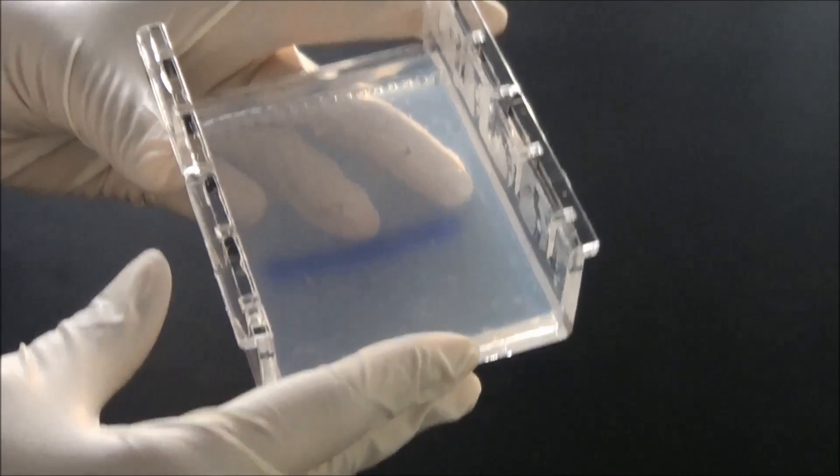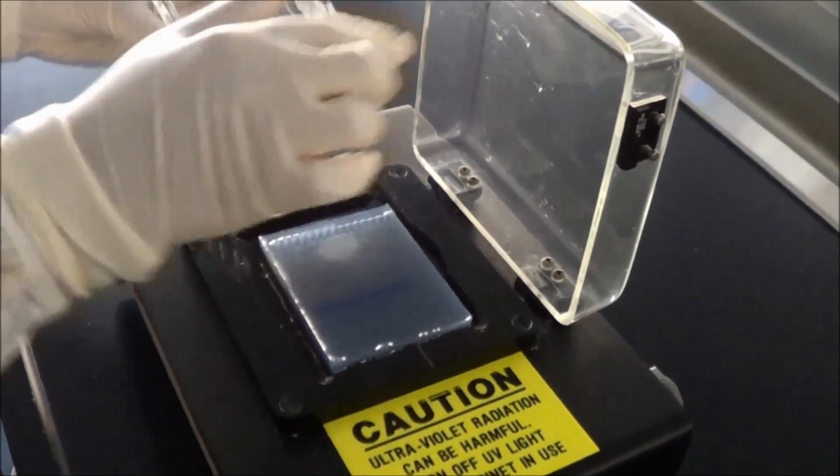After the gel has run, you then visualise it by carefully sliding it into a UV transluminator and check for DNA bands fluorescing.